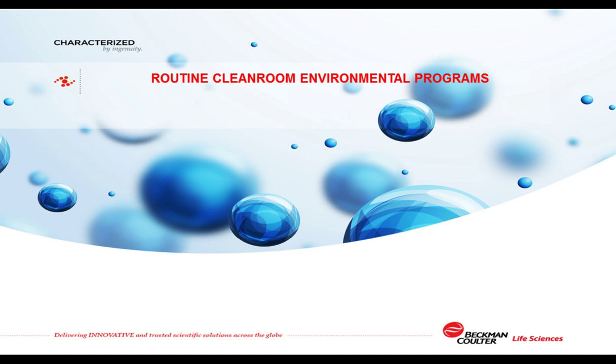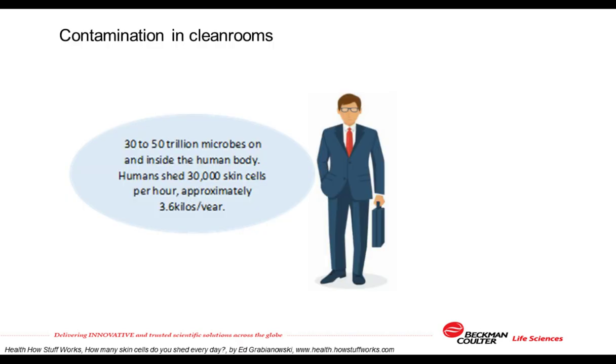So, okay, let's move on to take a look at what can be done to automate routine cleanroom environmental monitoring programs. Now, of course, the GMP documents mandate the air quality conditions for biopharmaceutical production in cleanrooms, but in fact, the real danger is the microbes on the human body. Humans shed around 30,000 skin cells per hour, all of which are potential carriers of microbes.